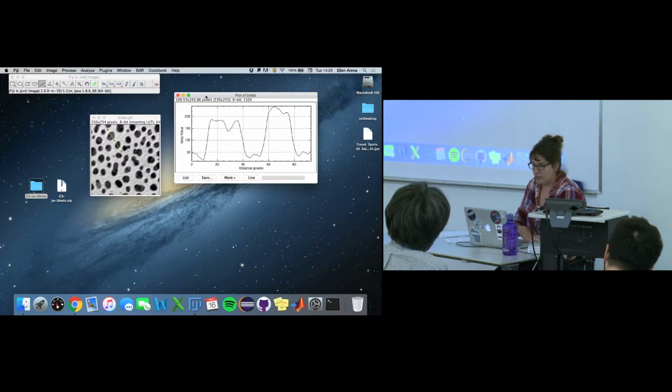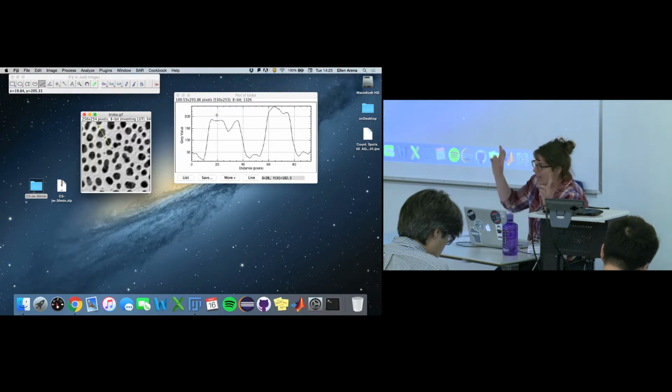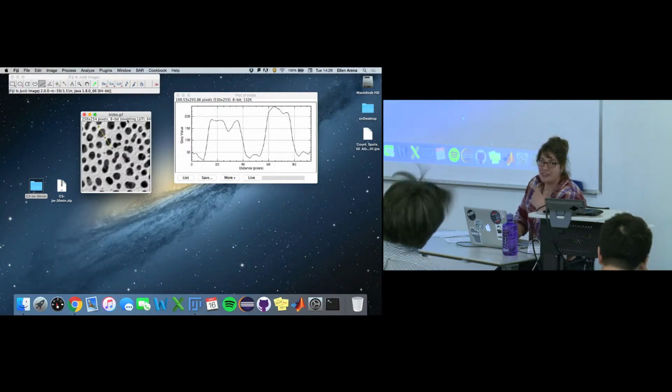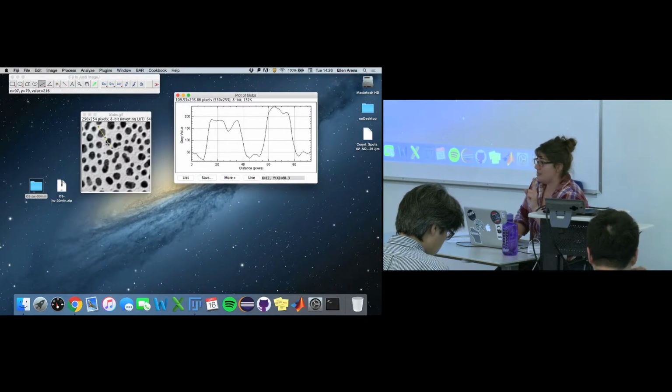Yeah, it's plotting gray value, because we're dealing with an 8-bit image, so we have values from 0 to 255. If you actually look at the pixel values over the dark blob, we get pixel values that are relatively high, right? For us, a high value is usually white, and low values are usually dark. So it's actually just showing us that this image is inverted, and it tells us at the top of the image that it's inverted. So it kind of cheated a little bit, but that's the thing. Just because the blob is dark doesn't mean the pixel values are low, in this case, right? It's not until you actually probe the pixel values that you can see that, all right?